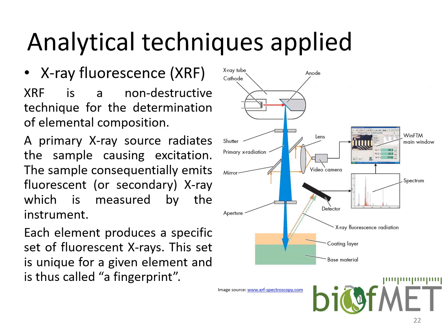X-ray fluorescence is also a very powerful technique. You can see that in all the previous techniques that we mentioned, you need to prepare the sample in a very rigid way. So you need to mix it with some strong oxidizing agents, acids, bases, and so on, in order to transfer it into analytical form. It needs to be a liquid, so you are completely destroying the sample.